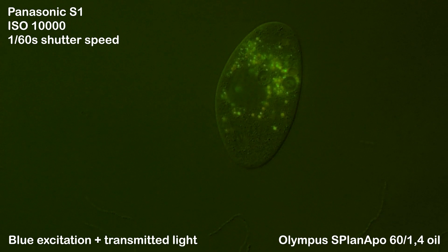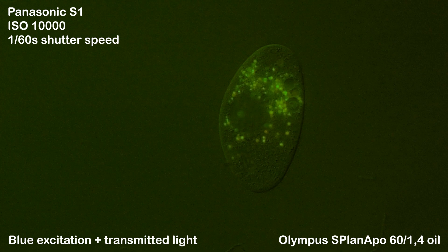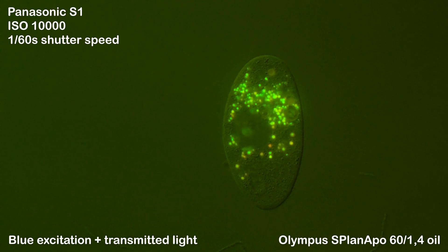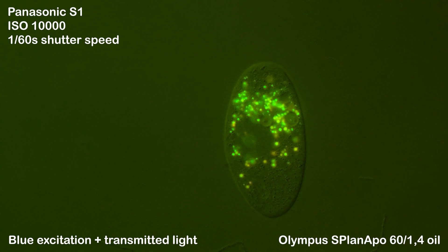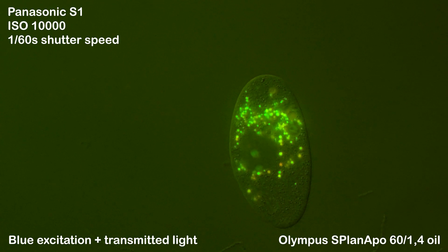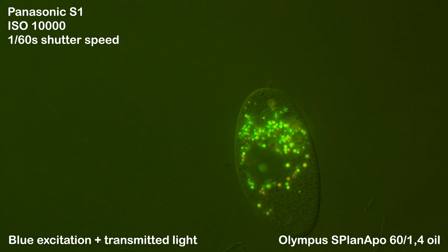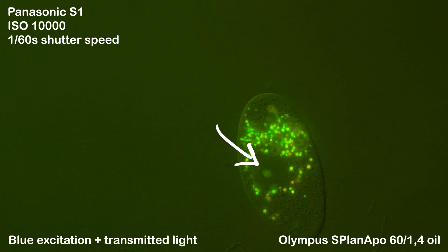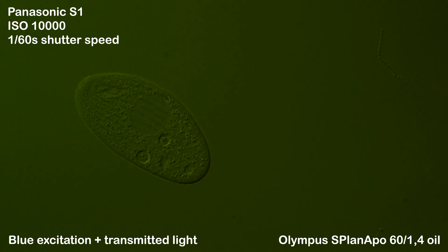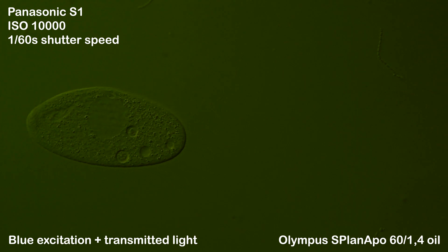As AO gives off a lot of fluorescent light, it is possible to mix in some transmitted light to observe the ciliate as a whole. You really need to fine-tune the intensity of both light sources to achieve optimal results and do as little damage as possible. In this case I use DIC in combination with epifluorescence to achieve an overlap of the AO signal and the other structures of the ciliate. You can also see very clearly that the macronucleus has not been stained by AO. When we quickly switch the LED on and off again, we can observe the AO signals appear and disappear.